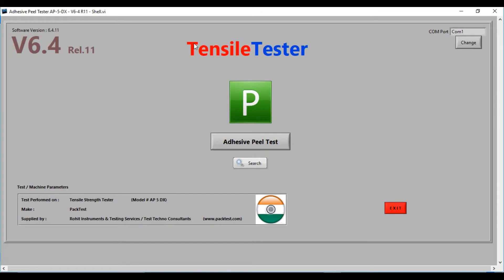Now let's set up the program. Start the software and click on adhesive peel test.